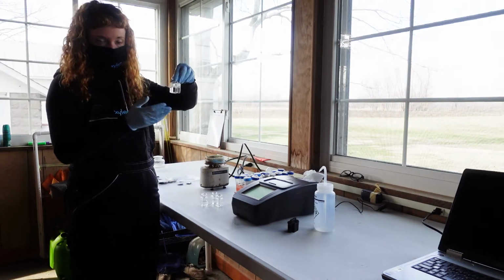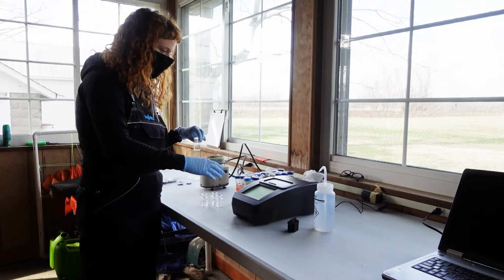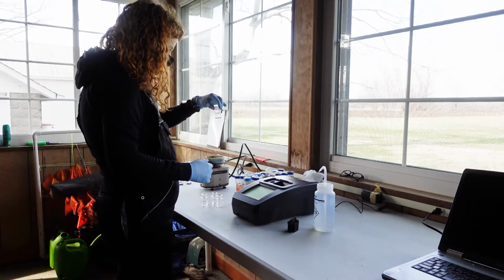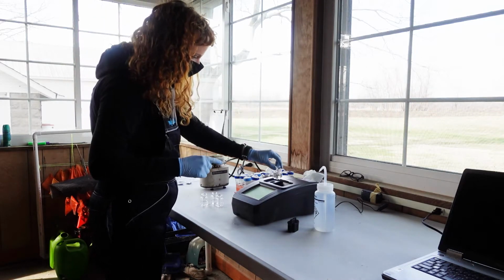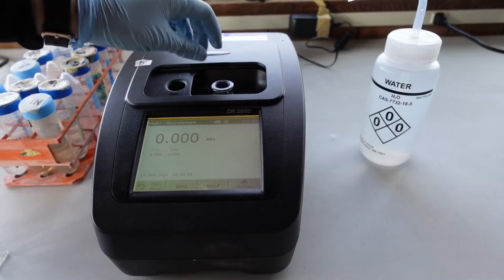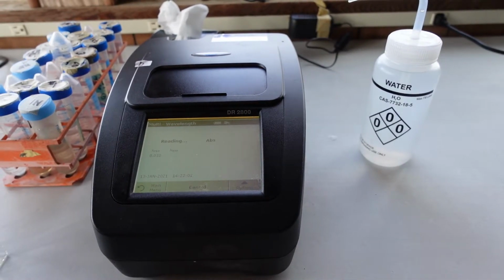So I filled my cuvette up to the 10 milliliter mark, and I'm going to read it in a very similar way as the 0 that I performed. I'll open the instrument. The optical path is going from your right to left. All right, and we keep that in mind. What we usually do is we'll look for that 10 milliliter mark and we'll place it in that direction. That way you're placing the cuvette in the machine the same direction every time. I'll close, and I'm going to press the read button this time. Last time we pressed 0, now we press read.